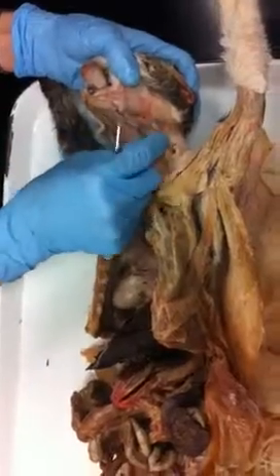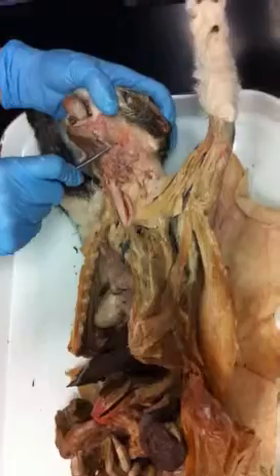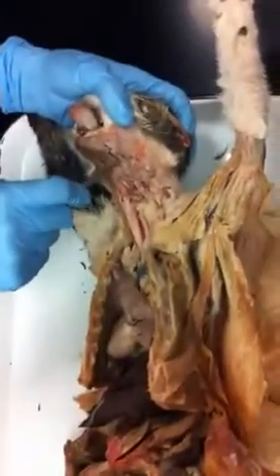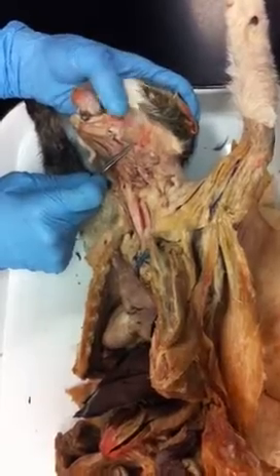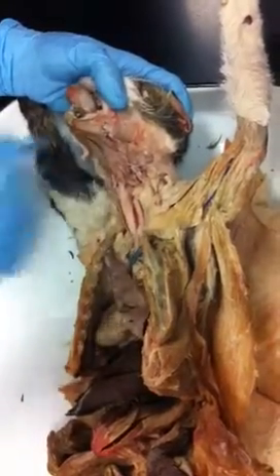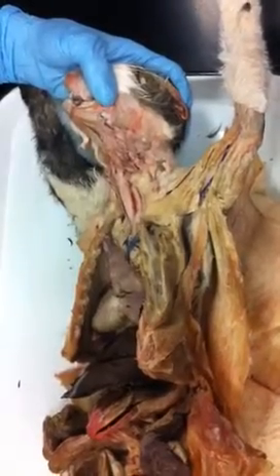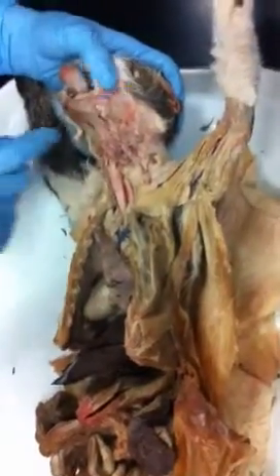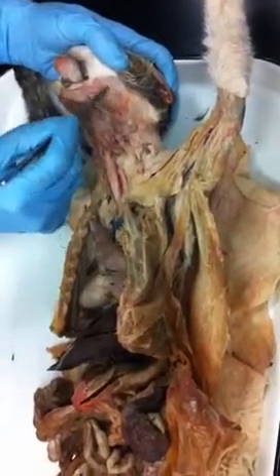That also delivers saliva to the back of the mouth, and the duct is in here somewhere. Right in here. The duct from the submandibular, carrying the saliva in, and deep to that, which you can't see very well, is the sublingual, and that's the one that comes out under the tongue. Okay, so it's parotid, submandibular, deep to that is the sublingual, this is the parotid duct.